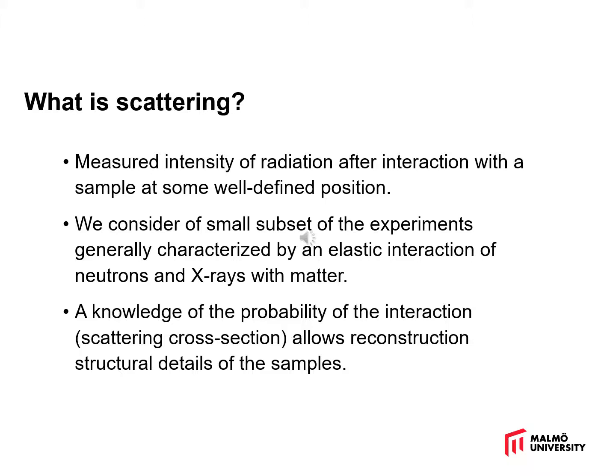So in the introductory lecture or webinar, I think it's really important just to think about what scattering is. What we're doing is measuring the intensity of radiation after an interaction with a sample at some well-defined position. The next slide will give that a little bit more graphically, what I mean by that.